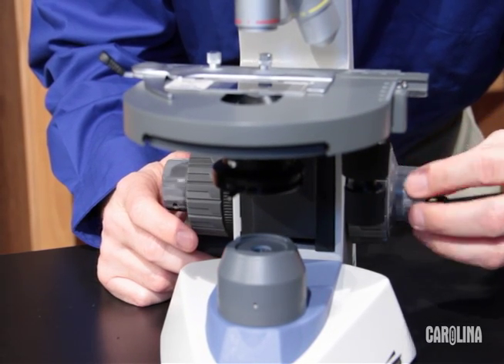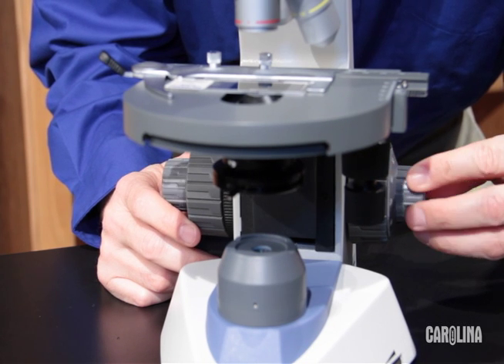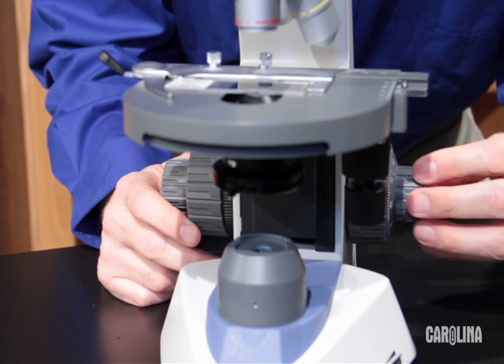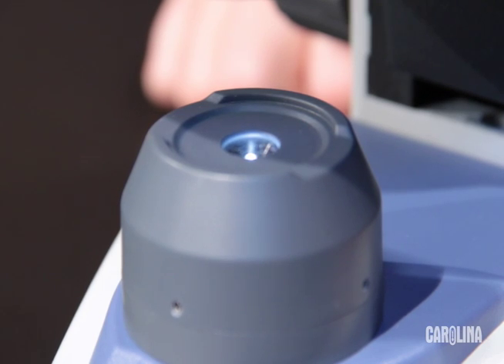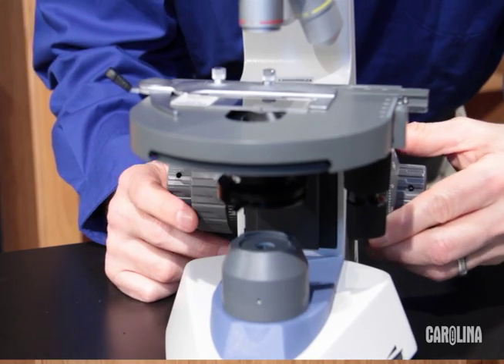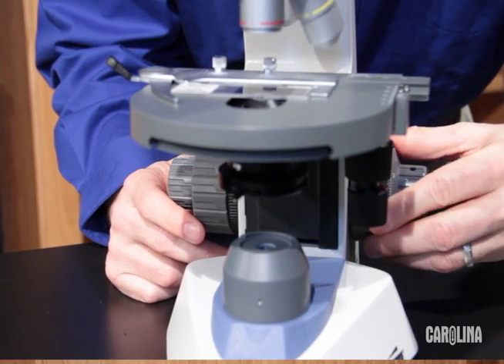Turn the coarse focus knob until the image is in focus then turn the fine focus knob to fine tune the image. At this point you may need to adjust the light to improve the image. After adjusting the light you also need to adjust the focus one more time.